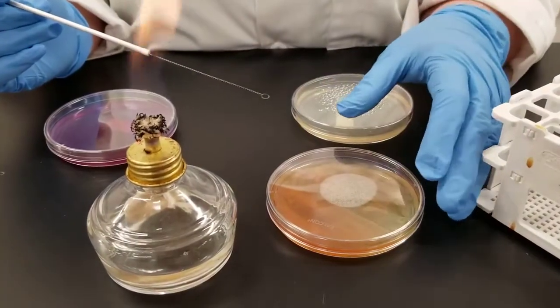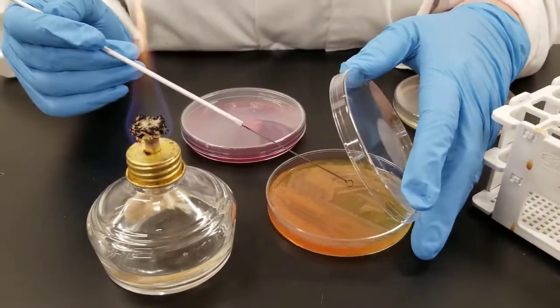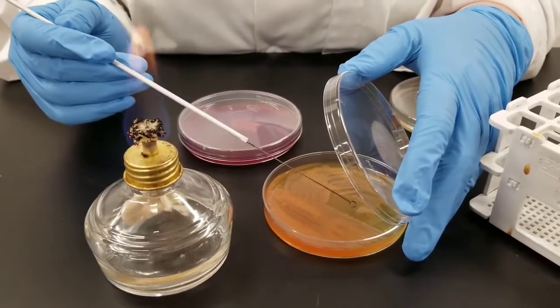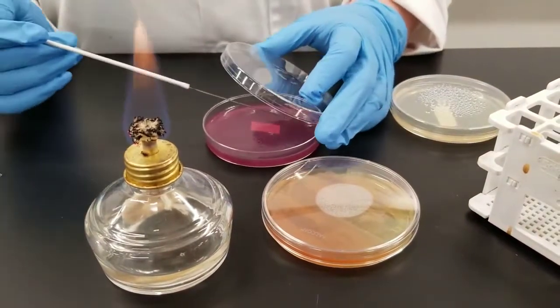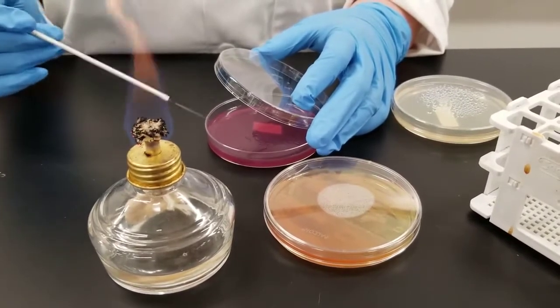This is our stock plate, so I'm going to take a sample from it. You just need to lift the lid and ideally try to find an isolated colony. Just gently scoop some up. Go to your next plate, lift the lid. We are not going for isolation, we just want growth. So I'm just going to streak gently back and forth across the plate.